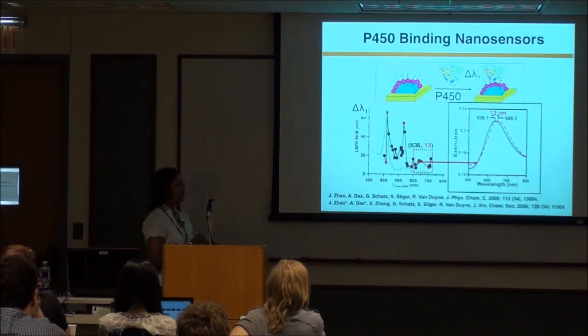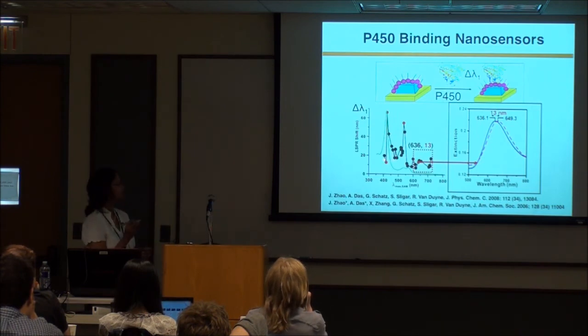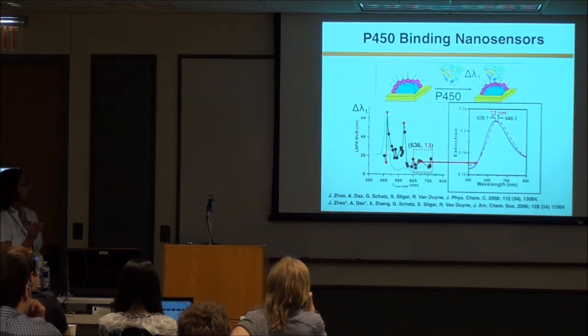This is our step 1, where we add the protein to the surface of the nanoparticle, and we see that this is the protein spectra, and these are the nanoparticle shifts. It is a little difficult to fabricate nanoparticles this blue because they start to fuse together. But after several attempts, we were able to fabricate a few particles which were this blue. They were absorbing around 400, 410 nanometers. So you can see that when it overlaps, there is a dip, and there's a huge enhancement, almost 60 nanometers, when it is slightly red, and then again the average comes around 20.